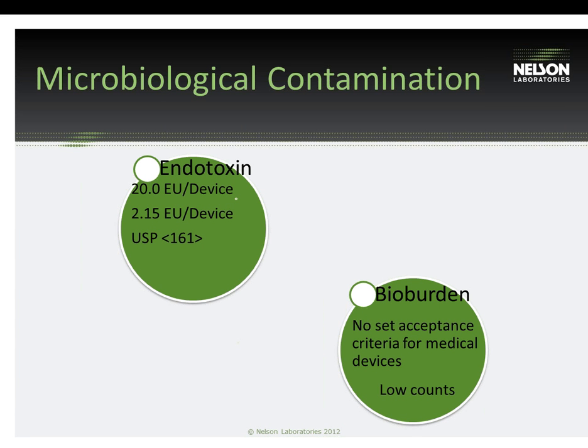The endotoxin and bioburden tests are also mentioned in that overall governing ASTM standard that we mentioned previously, the 2847, that discusses these cleaning validations as a whole. The cytotoxicity test is not mentioned in that standard, but that's just a Nelson Labs recommendation.